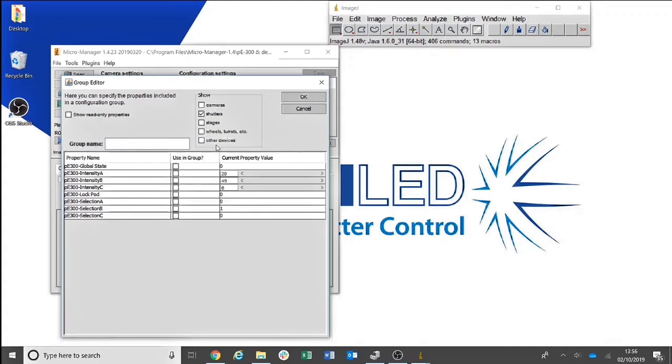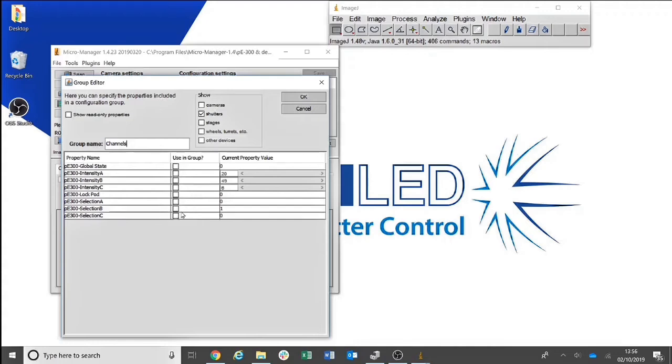Give the group an appropriate name. In this case, I will call it Channels. As we will only be controlling the selected channel in this group, you will only need Selection A, Selection B and Selection C. Intensities will come later. Then click OK.